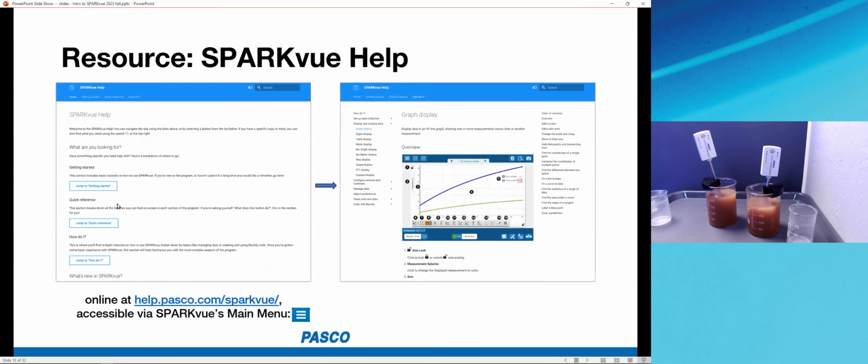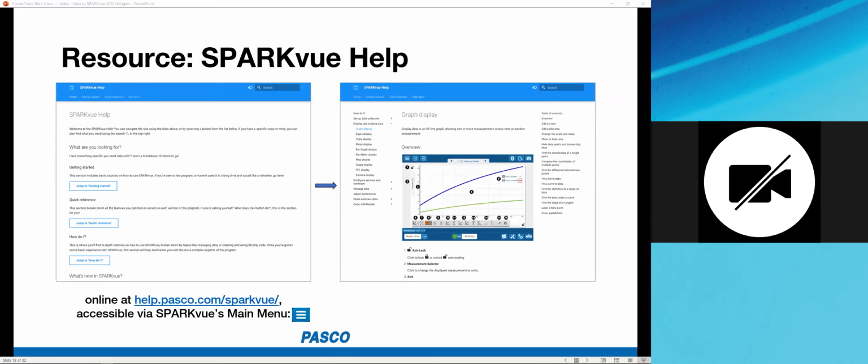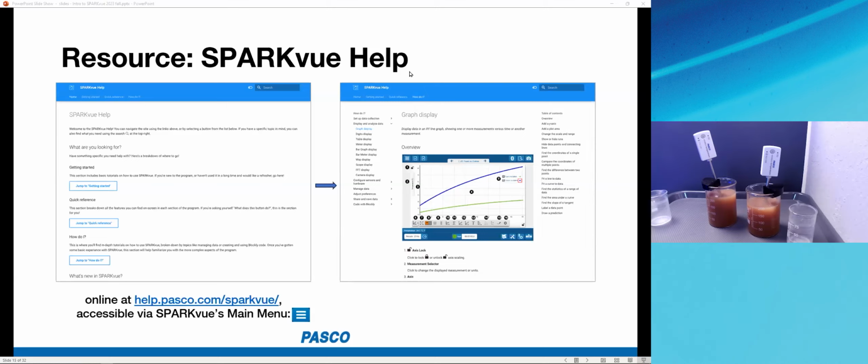All right, Heidi, before we continue, any questions that we should address? No other questions have been coming in. Oh, wait, one just did. Can the data be exported to an Excel file? Julianne, thanks. You've segued into the next activity beautifully, and I will answer that. The answer ultimately is yes, and I'll show you how to do that after the next activity. Thanks, Julianne.